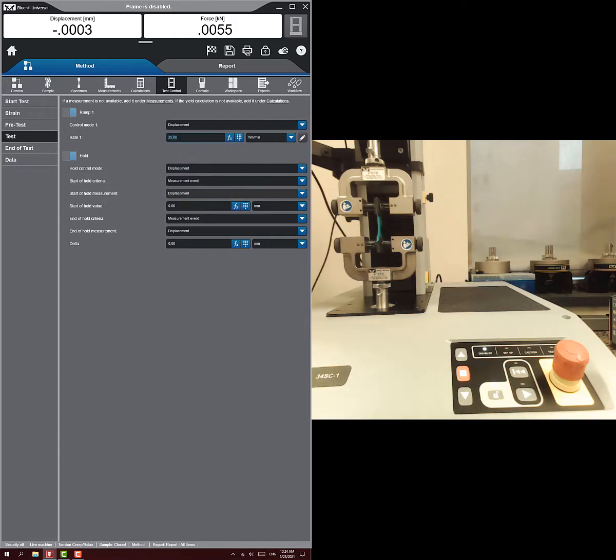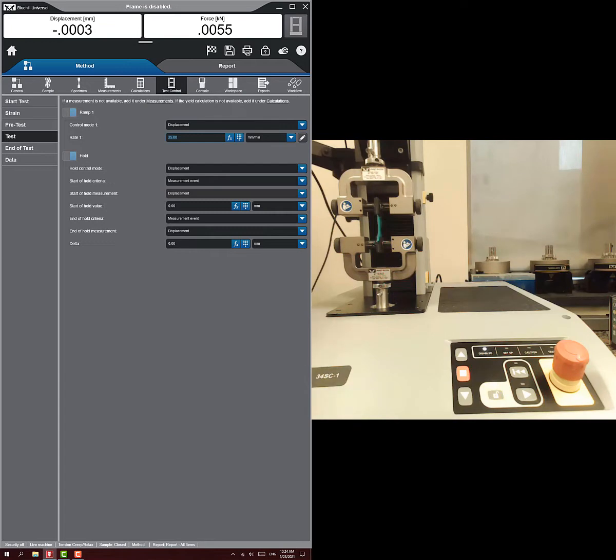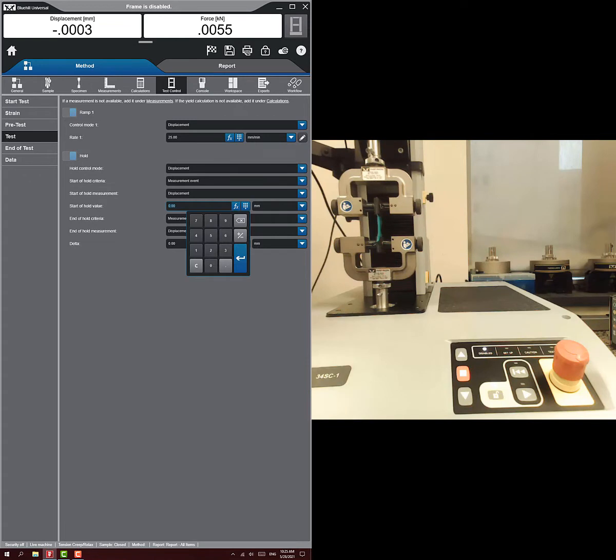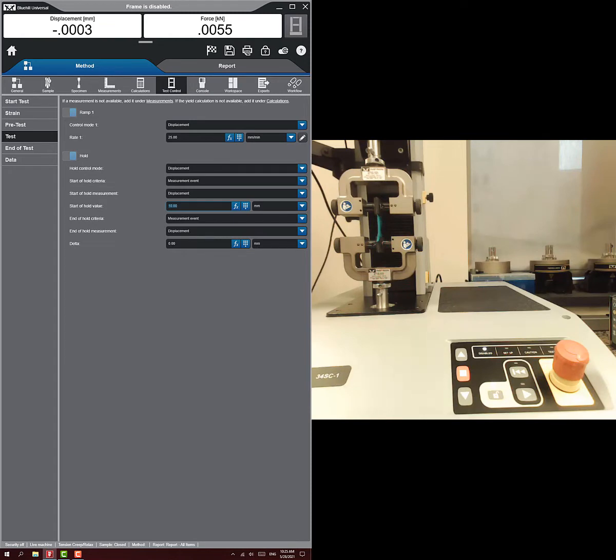Now we want to decide when we want to start holding. It says start of hold measurement is going to be at some value, and so we're going to want to set that value. Let's just say I want to go to 10 millimeters to start the hold. That seemed to be a decent distance based on what I observed from the glove last time.